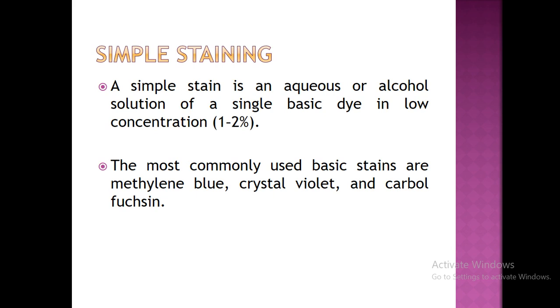In any staining technique, certain colors are used and they are called a stain. A simple stain is used in simple staining. A single type of stain is used in simple staining.